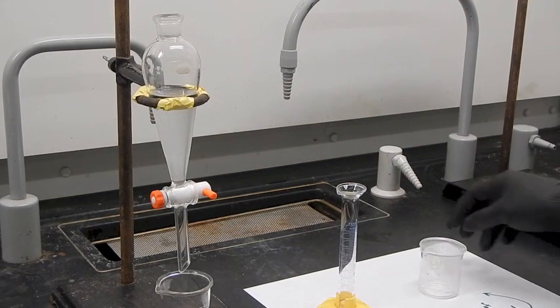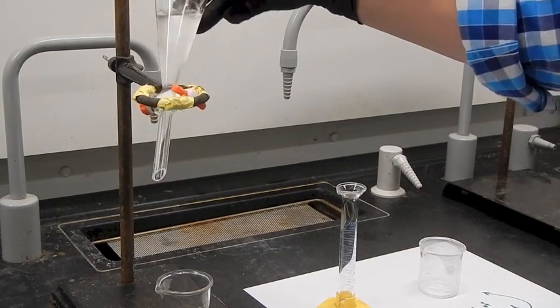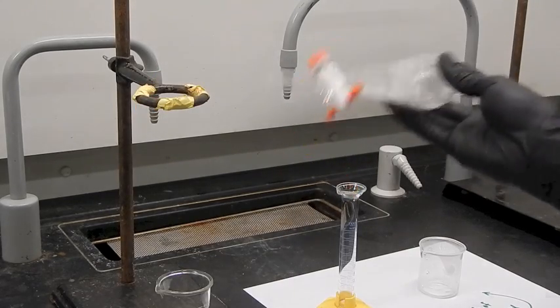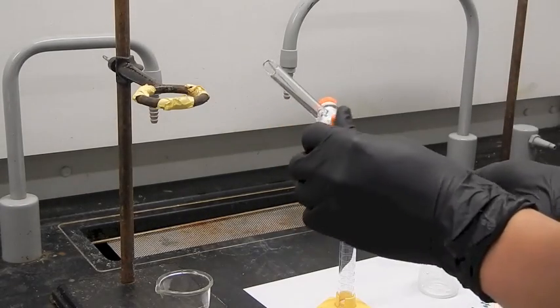Okay, so now that I've added both of my starting materials, my alcohol and my concentrated HCl, I'm going to shake and vent my reaction mixture. So holding the stopcock on, shake it a few times, point it into the hood, open the stopcock to vent, and I'm going to do this for about 2 minutes.